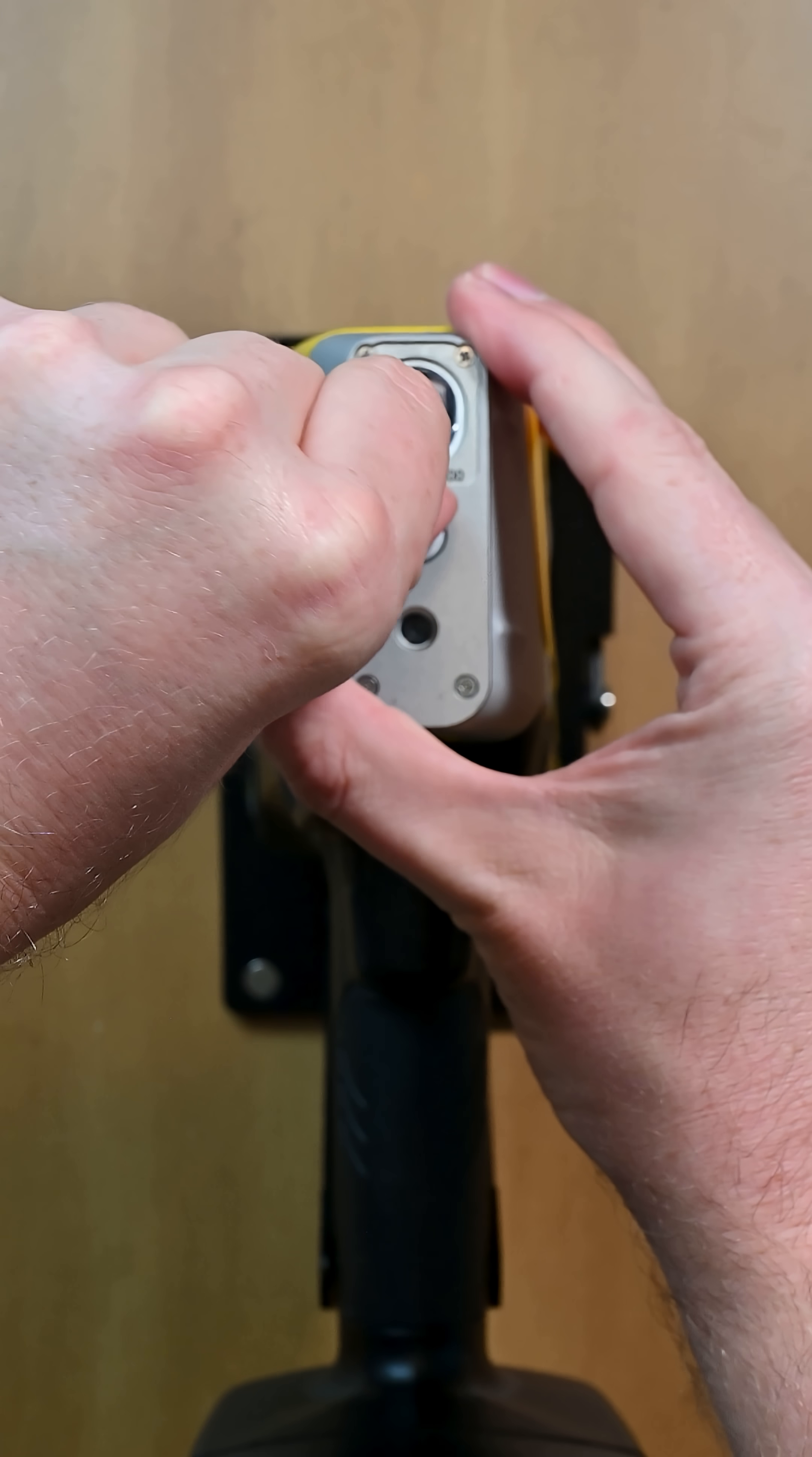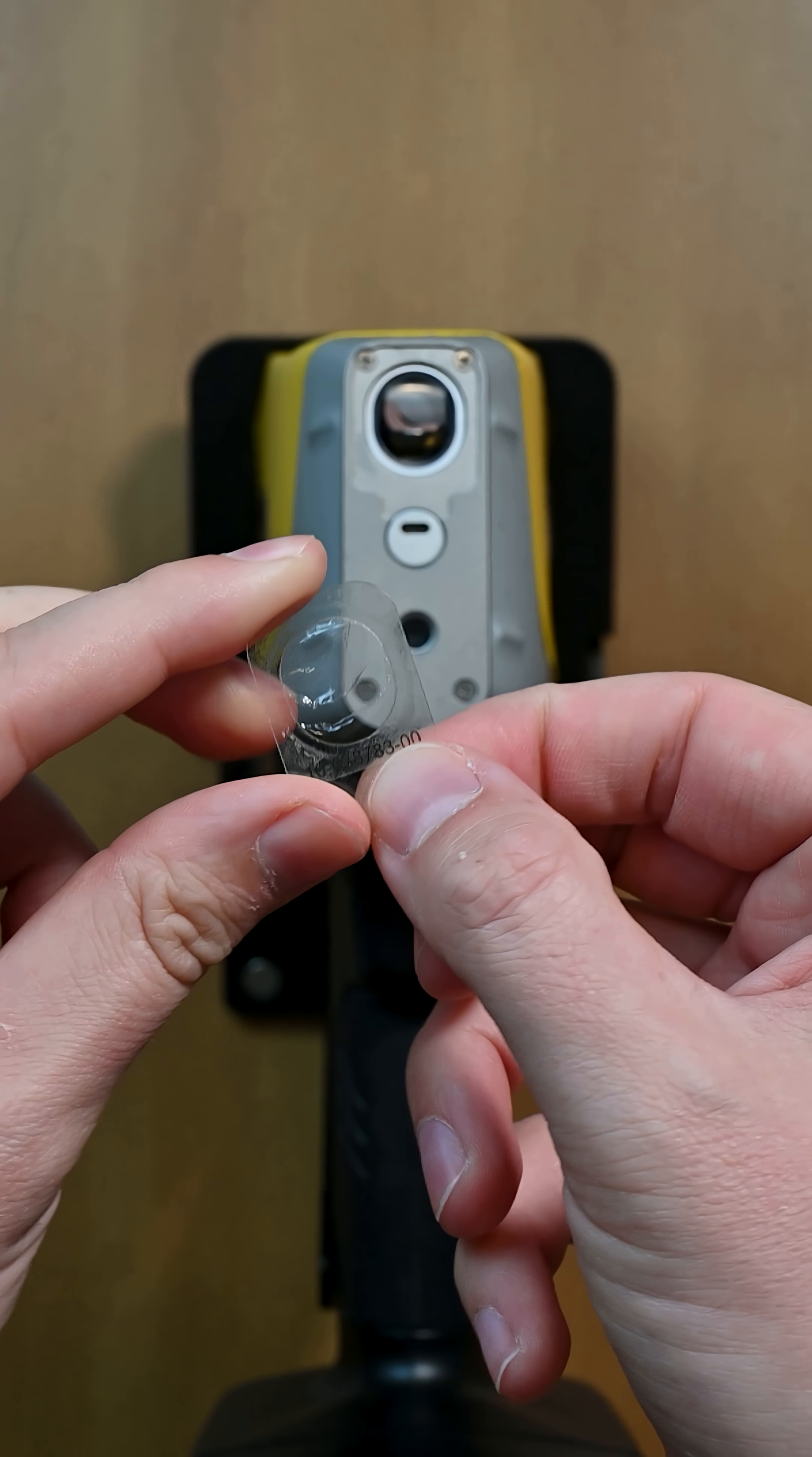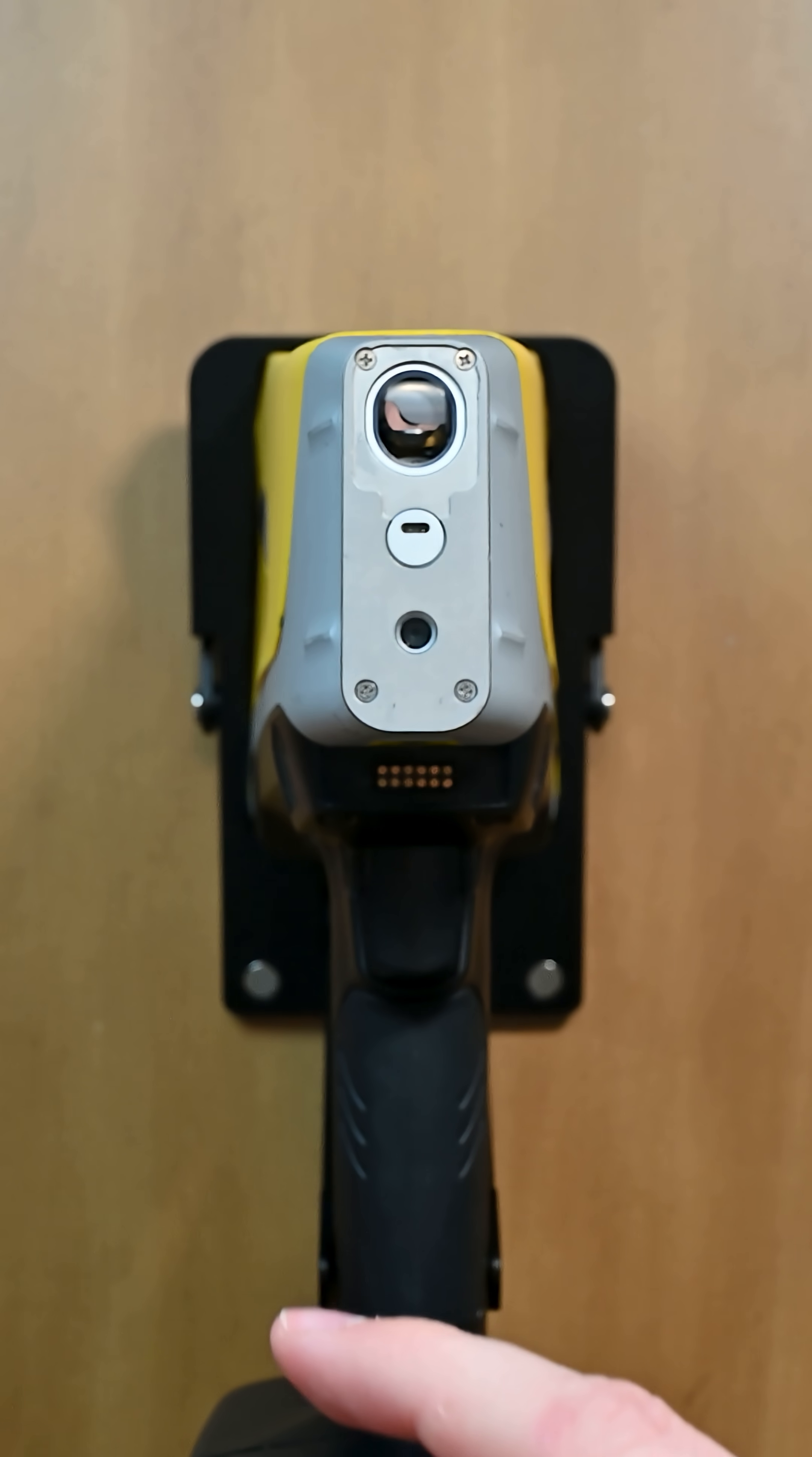So to remove the old window, first I'm just gonna pull the tab on the bottom. The window comes right off. Now this window does have an adhesive that is used, it's a two-layer window, and sometimes this will come apart. Just make sure you remove all the old window ahead of time.